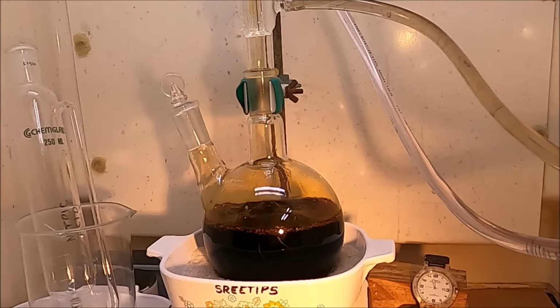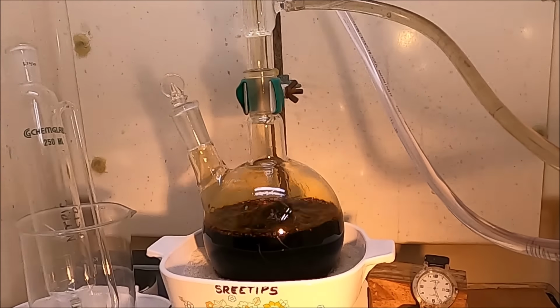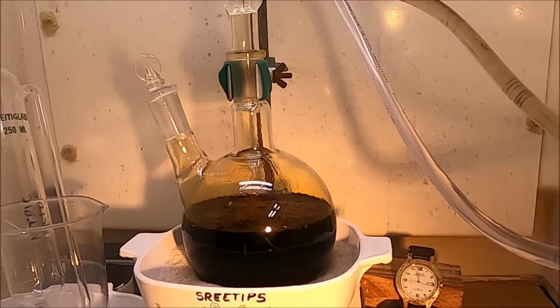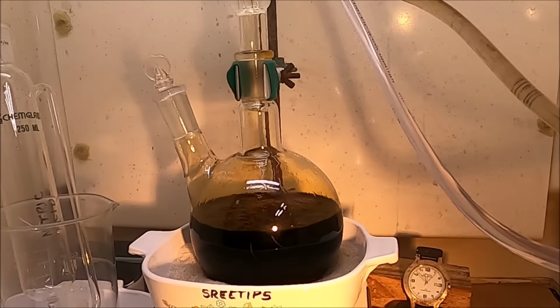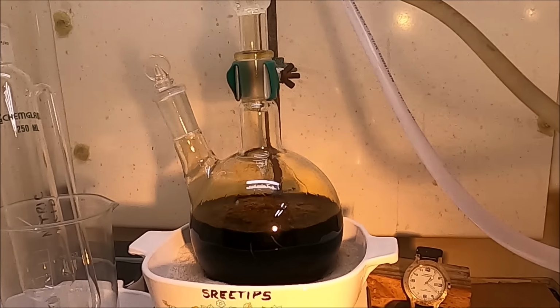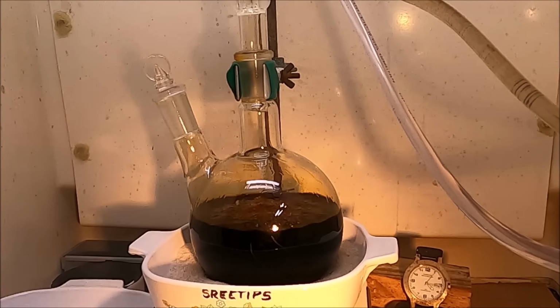This is about 12 hours worth of reflux. There's not much to see here, and the goal was to get all the available free nitric acid used up to try to get all that platinum that we have in that flask to go into solution. I figured reflux is the best way to do it.